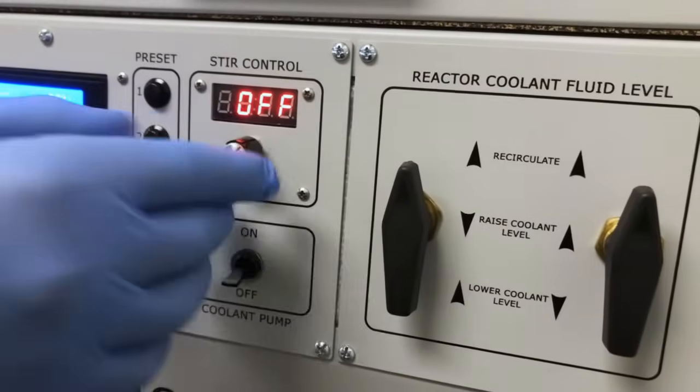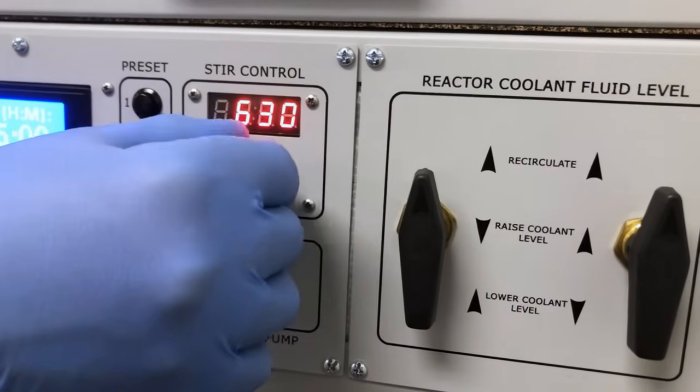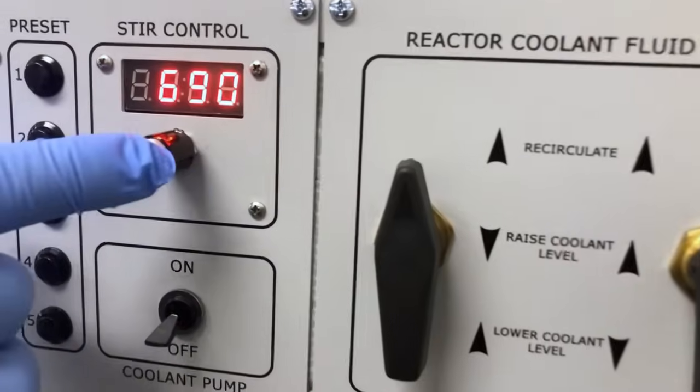The stir control allows you to set the speed of the heavy-duty stirring magnets under the reaction chamber. Simply press the control knob and turn it on or off.